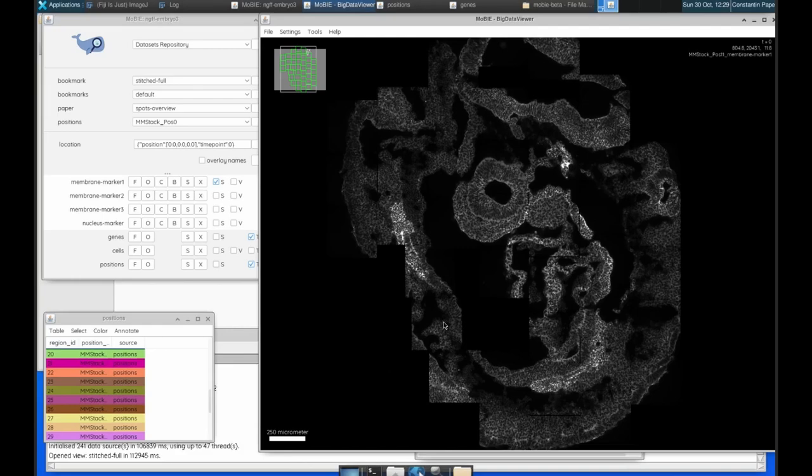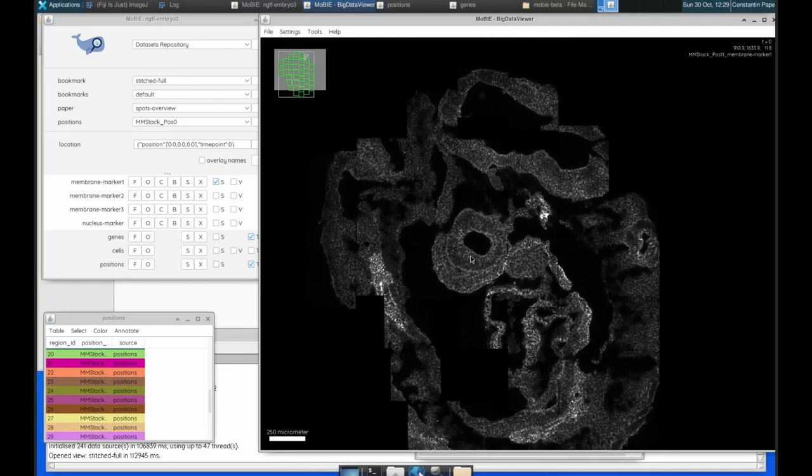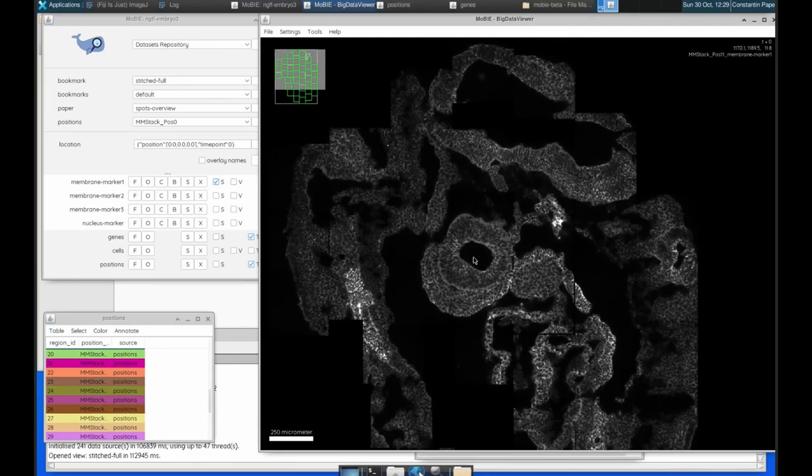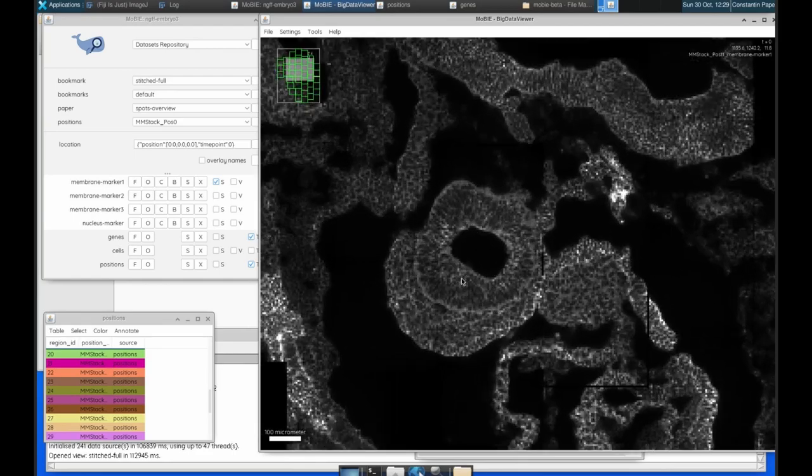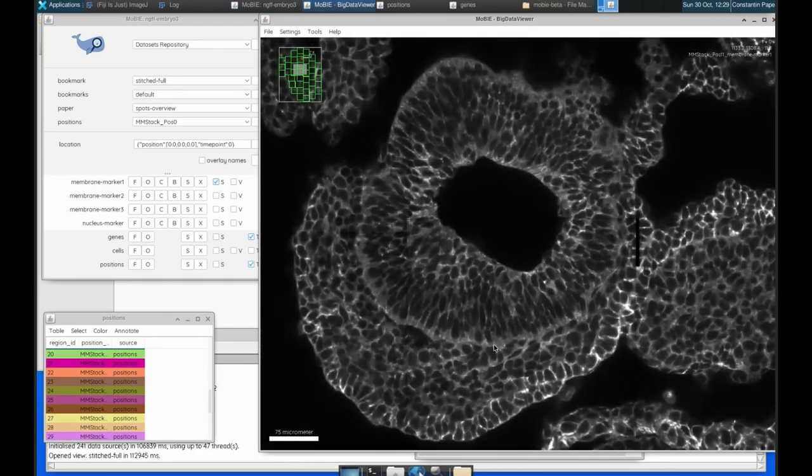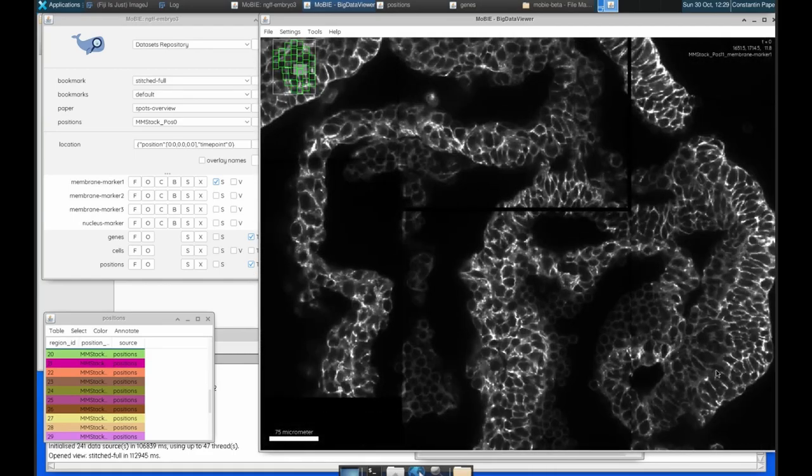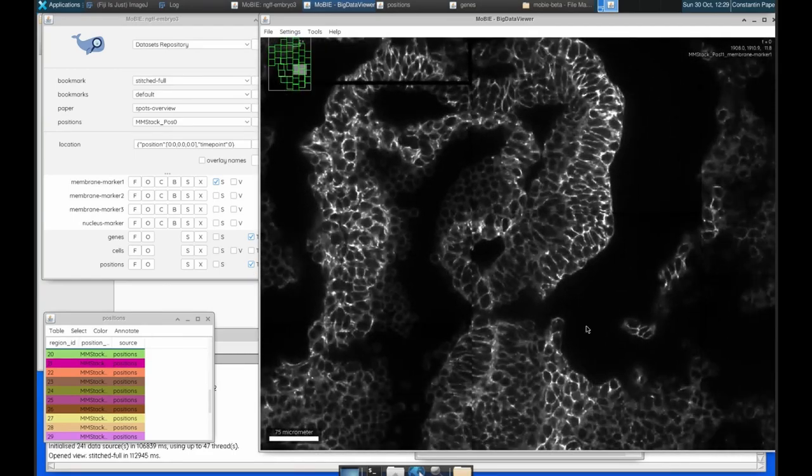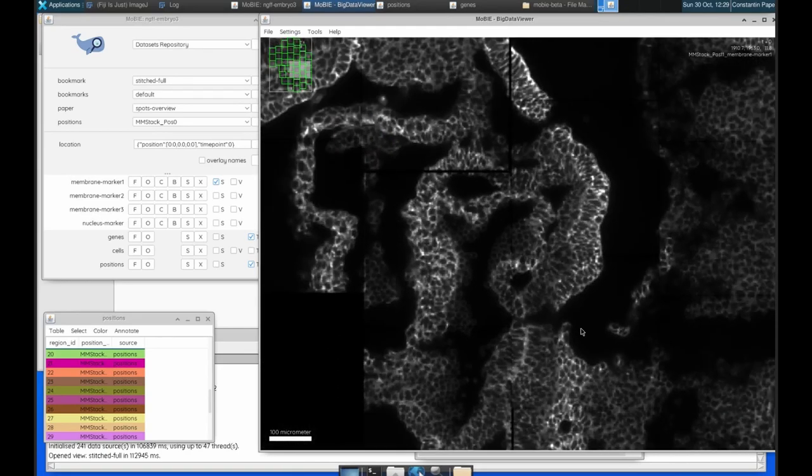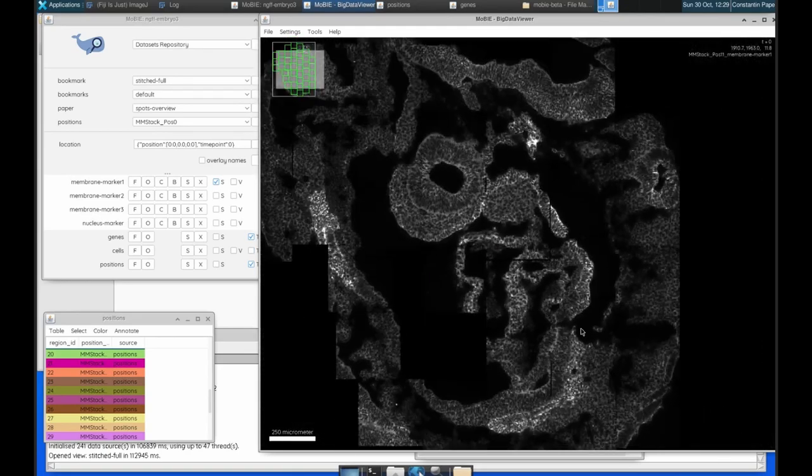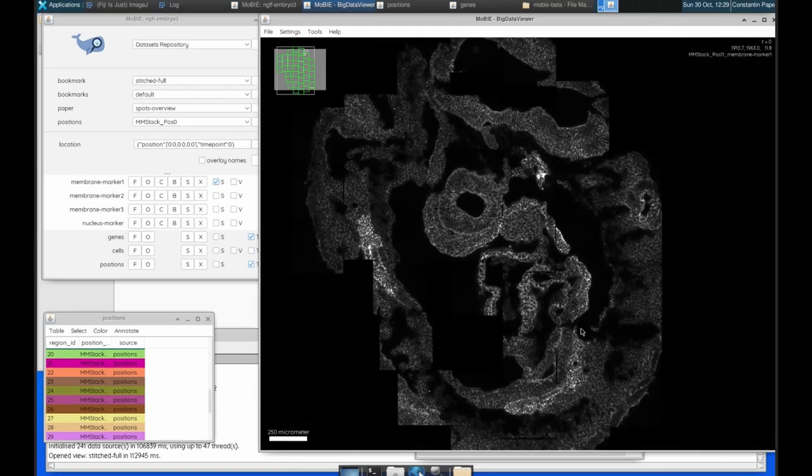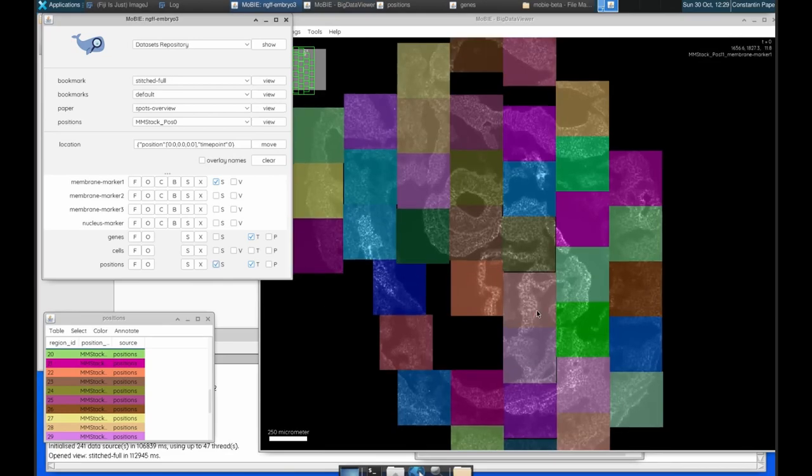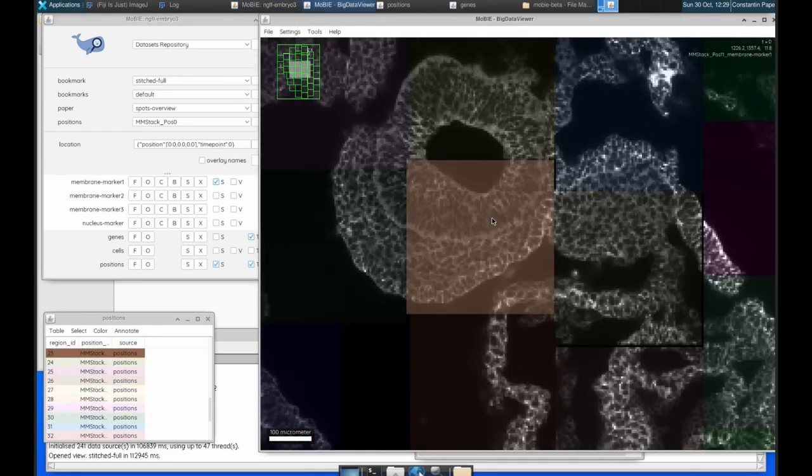This dataset is made up of 40 different image tiles. They're all stitched together using affine transformations which are applied on the fly in Mobi. So as I move about, you can see these different image tiles here. Now if I go over here and activate this positions layer, you can then see in these different colours the different tiles.